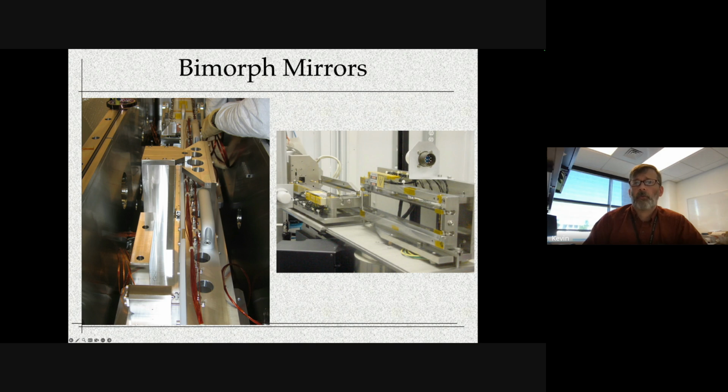So you've got one mirror that's flat face up, and you've got another mirror that's standing up on its edge. And so the mirror that's face up, when it's bent, that will focus things vertically. So that'll squash things down vertically. And then the X-ray beam will come off of that, hit the mirror that's standing up on its edge, and then that will squash things horizontally. And so you'll get focusing in the two different planes using the two sets of mirrors that you have.